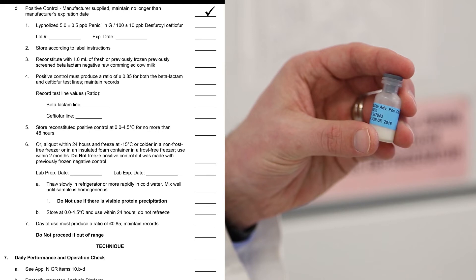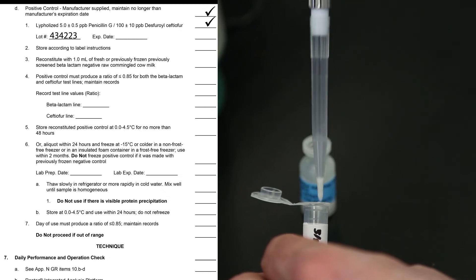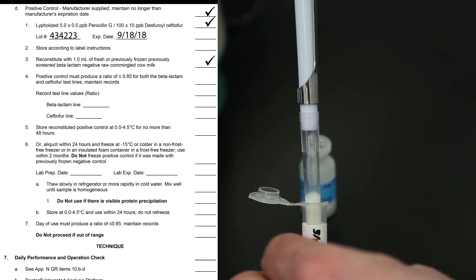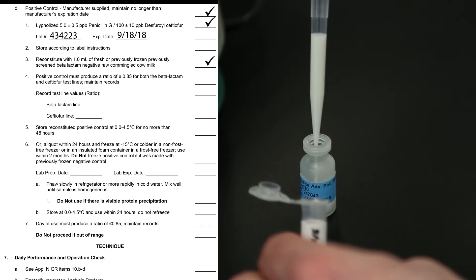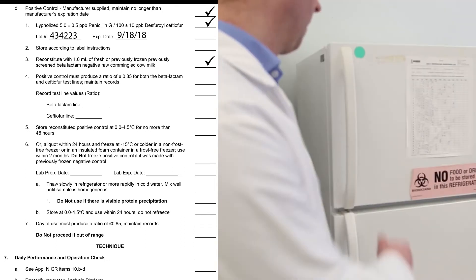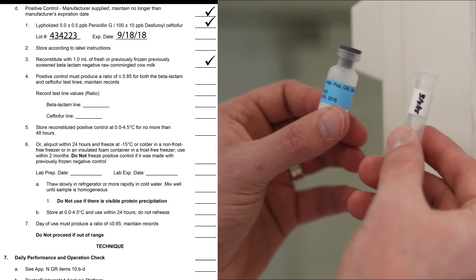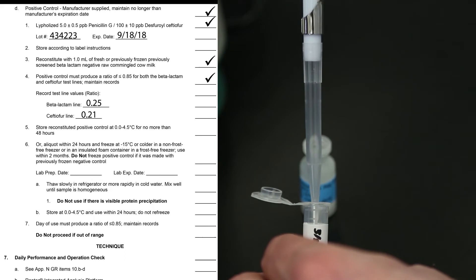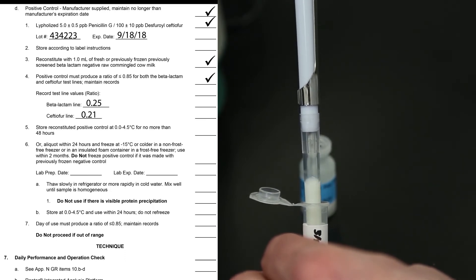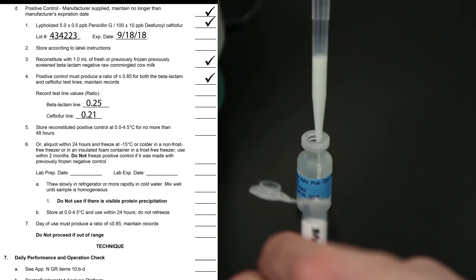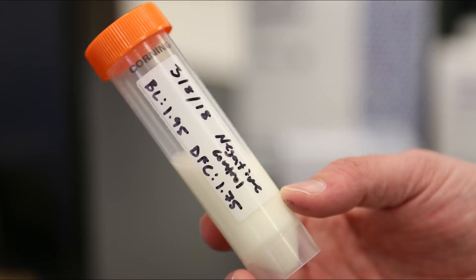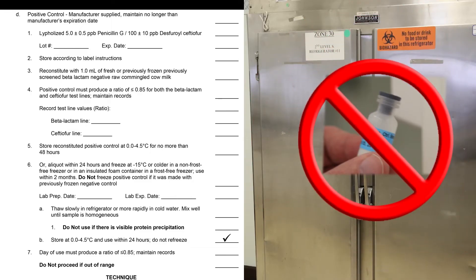Neogen supplies positive controls that contain two different beta-lactam antibiotics. Positive controls are prepared by reconstituting the drug with one milliliter of negative control milk. If using a previously frozen positive control, it should be properly labeled and have the ratios on the label. If the positive control is being prepared fresh, you'll need to come back and complete the ratios after the daily performance check is complete. Just like negative controls, positive controls can also be frozen — but do not freeze positive controls if previously frozen negative milk was used to reconstitute the positive control.